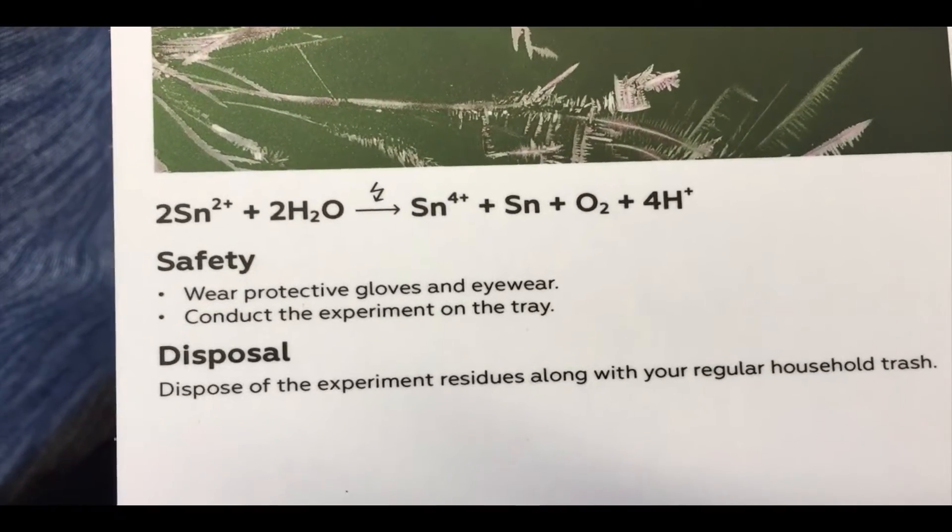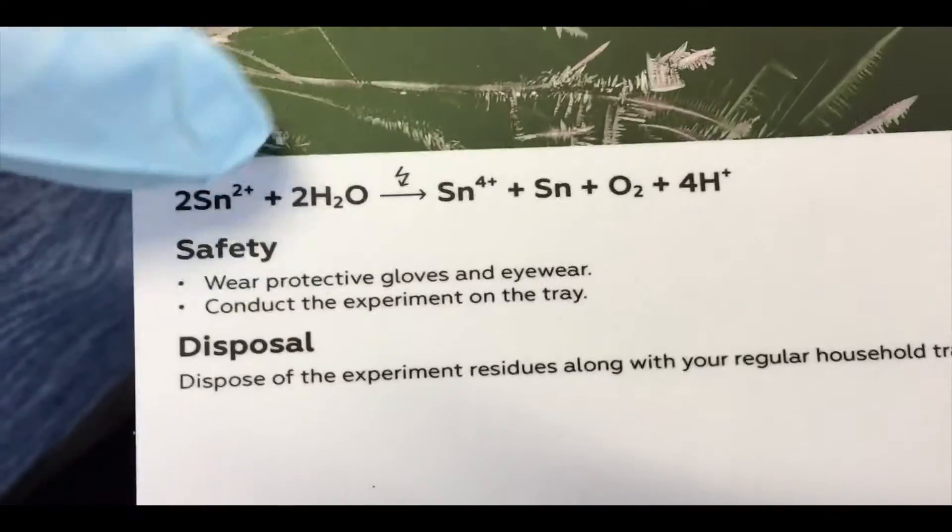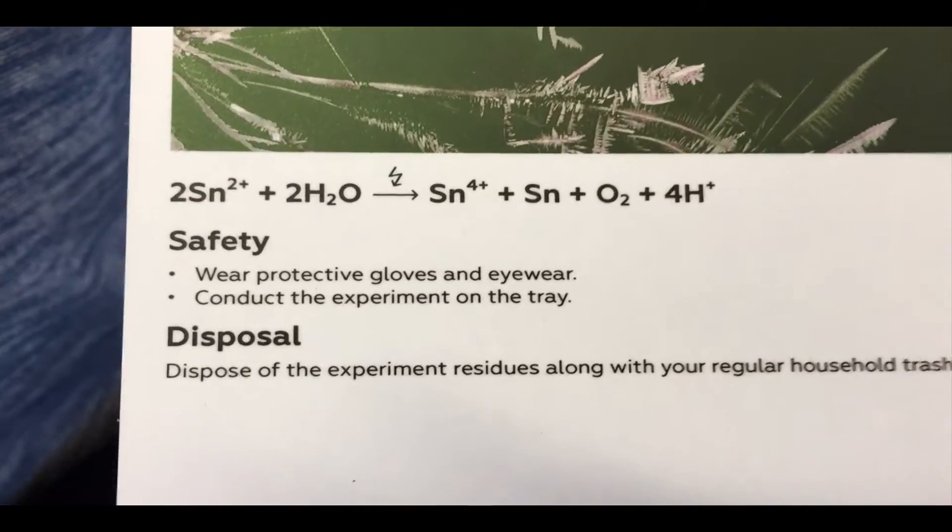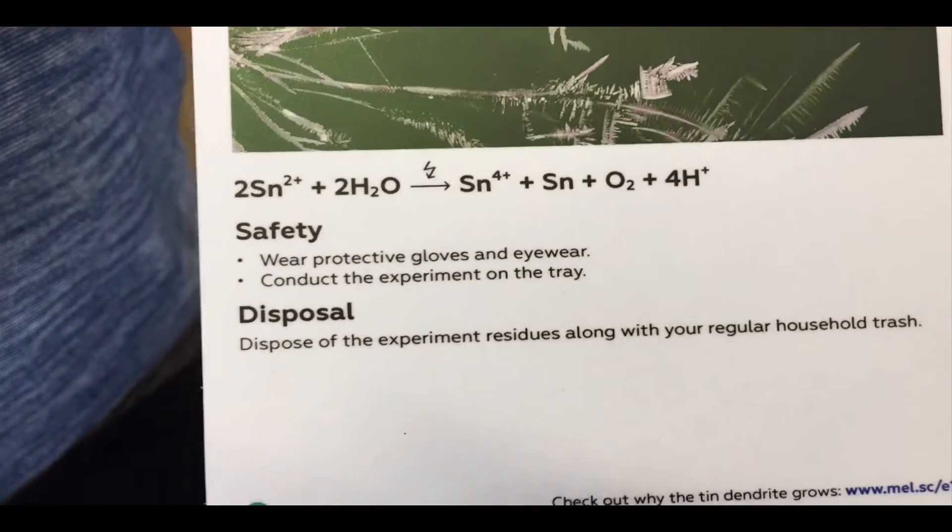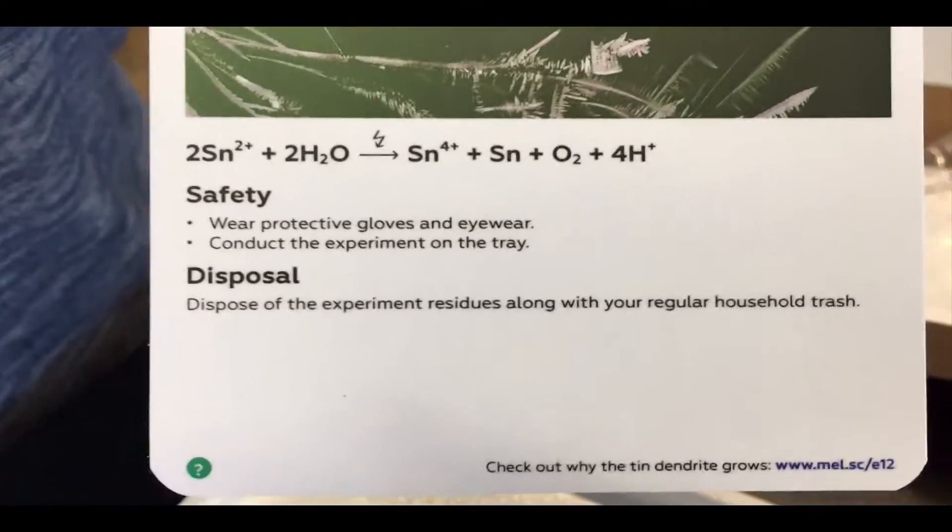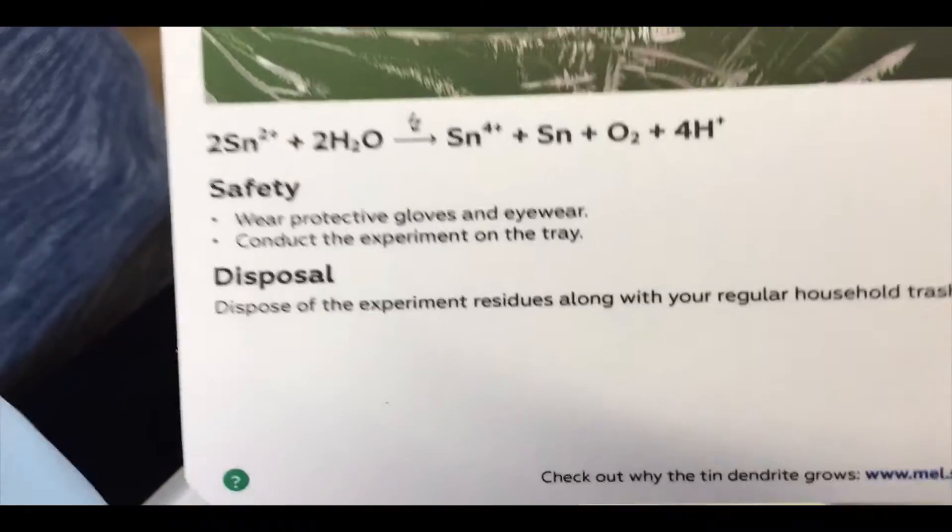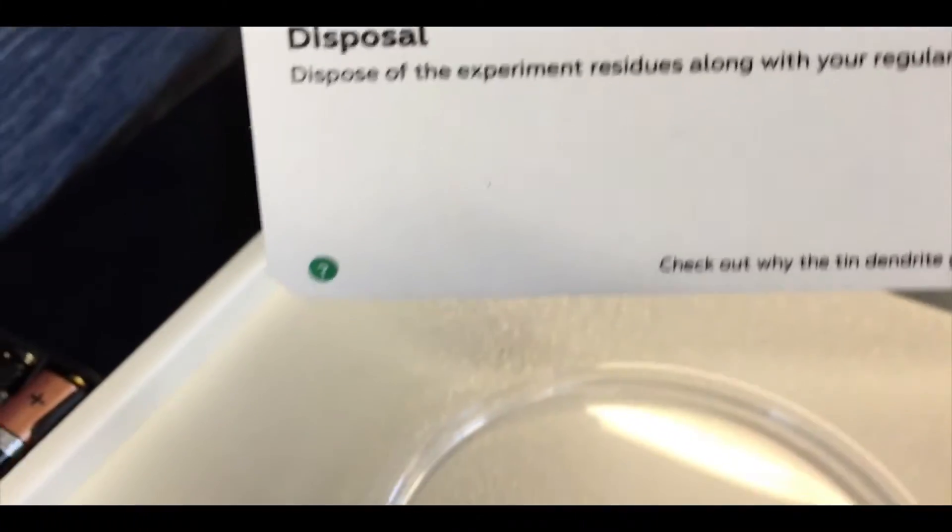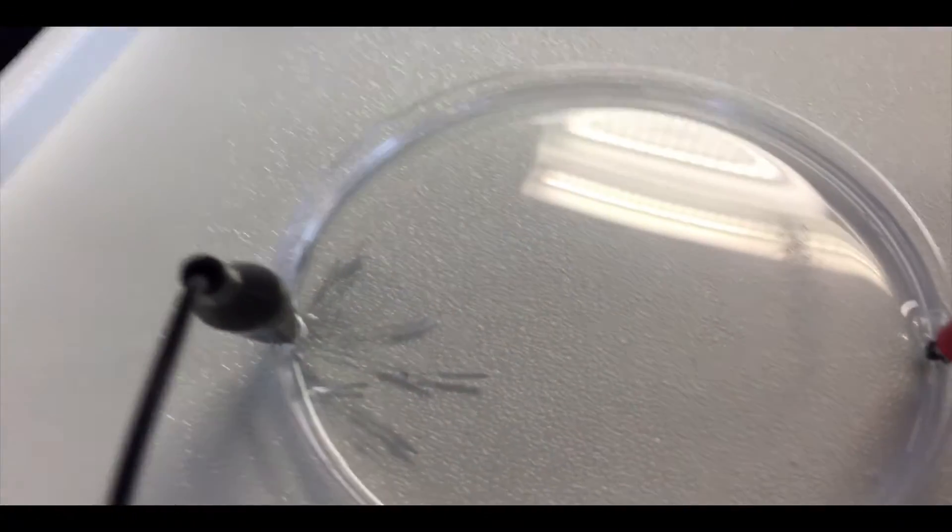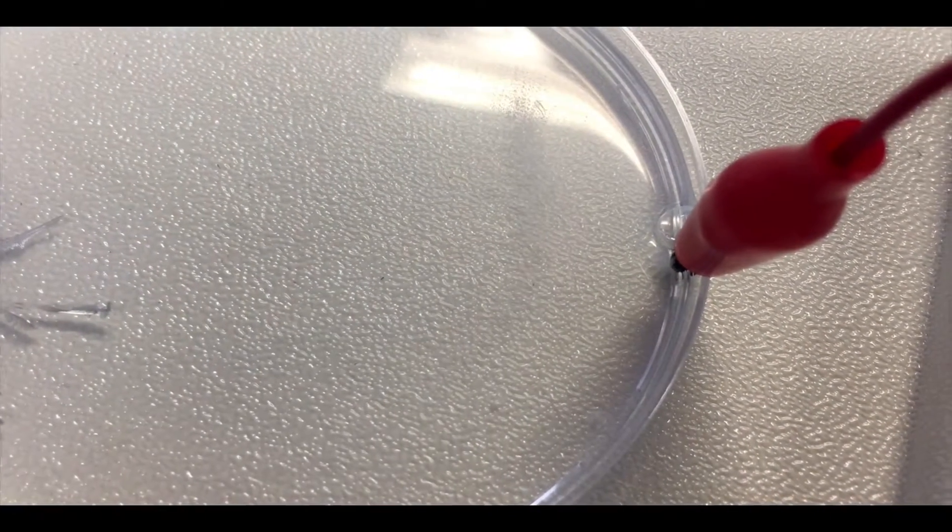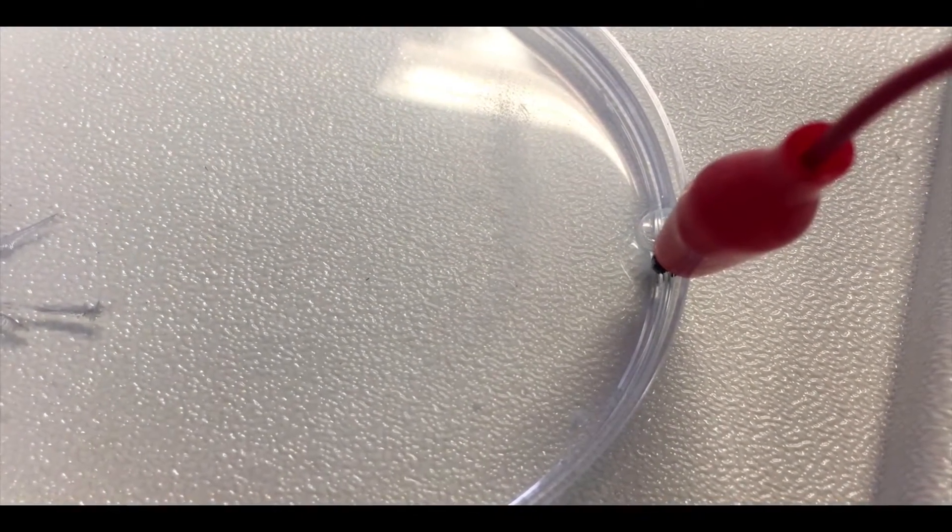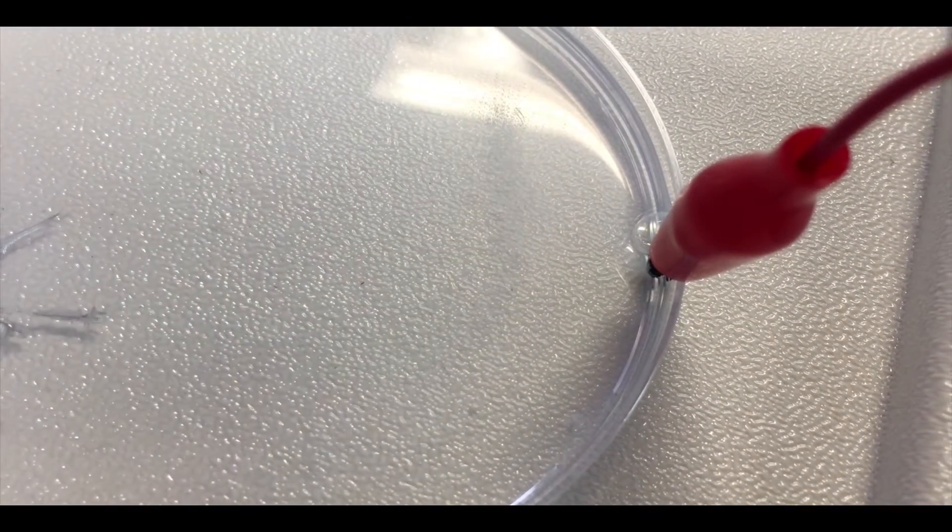So the electrons are reducing tin-2. The electrons really are coming from the water—they get pulled up over here at the red electrode, and then the battery kind of drives them in on this side. We should also see bubbling somewhere—we're producing oxygen gas. There is a bubble on the red side, so that is slowly growing.